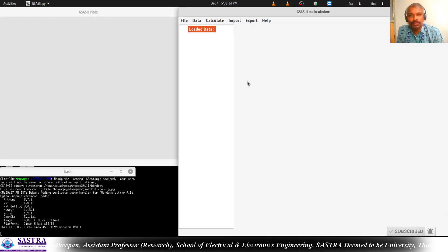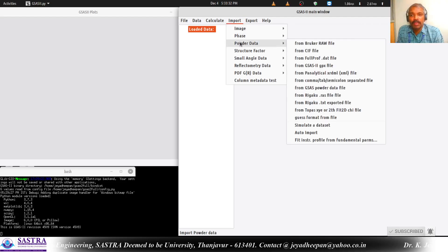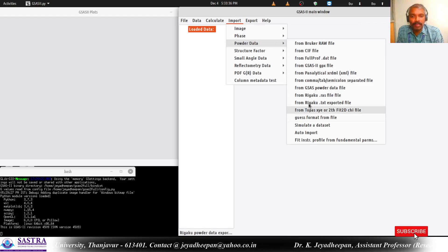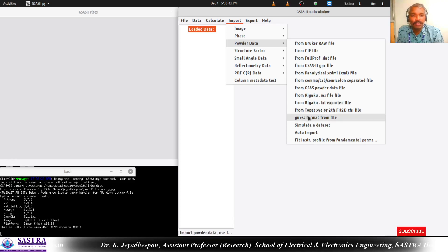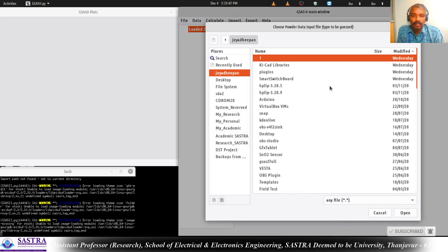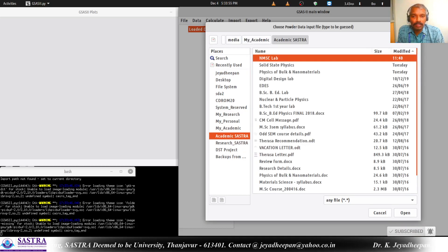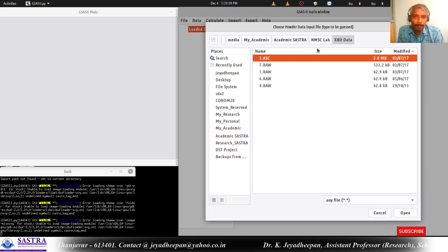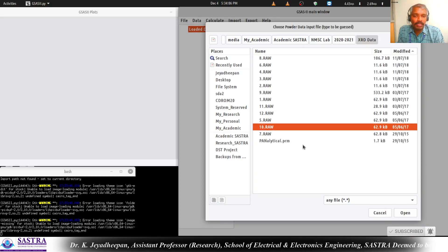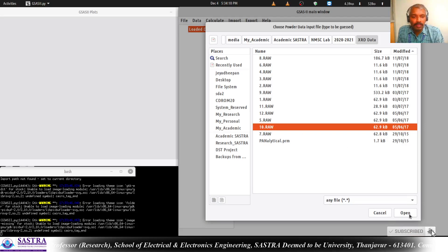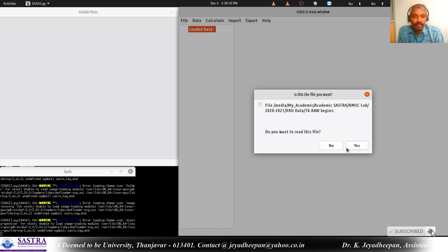To do the semi-quantitative phase analysis we have to import the powder diffraction data. For that you go to Import and then Powder Data. If you know the file format you can select any format and then select the data. Otherwise, if you do not know the file format, you just simply press 'Guess format from file'. It will ask you to browse the file. Here I have saved the data in the XRD data folder and I will select a file called 10.raw. I am opening that file now. It will ask you to confirm whether the file is correct or not, so you just press yes.